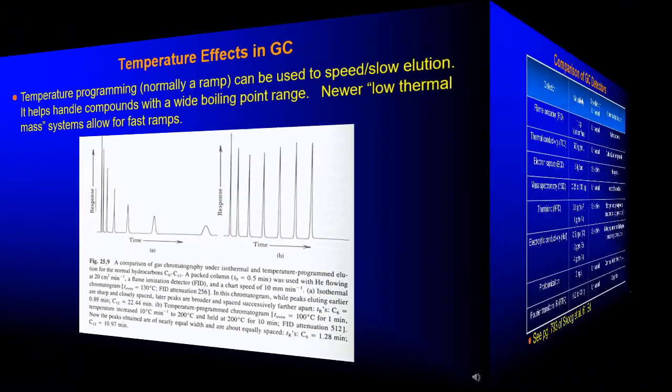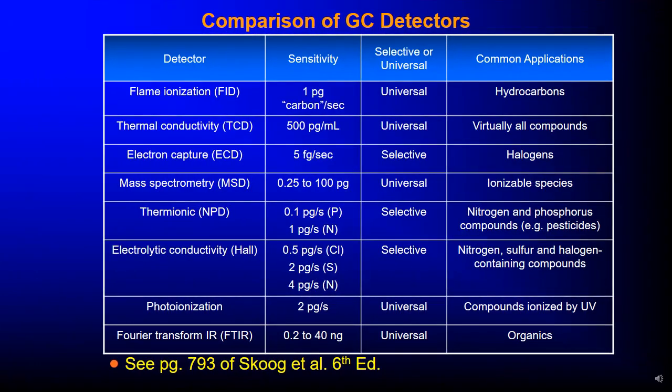Then comparison of gas chromatography detectors. Of course, we have flame ionization, universal and majorly for hydrocarbons analysis. Then we have thermal conductivity, virtually all compounds can be used.